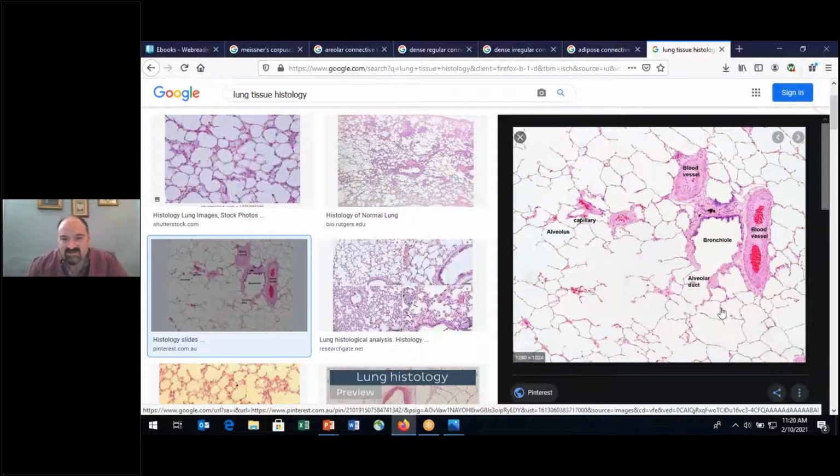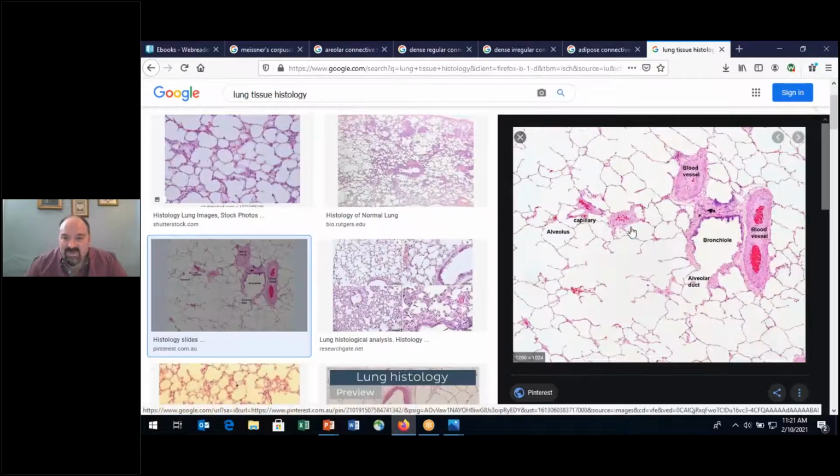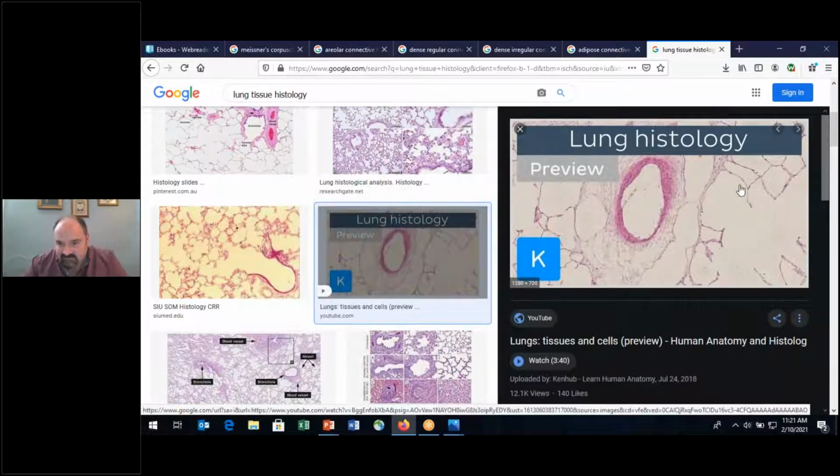So you'll see here, does this look a little bit like this? It does a little bit, right? But what I'm showing you is that with this one, they don't all come together. Some do, but some don't. You'll see that there are spaces and gaps, because these alveoli are little bubbles of tissue. And the tissue here, all these little lines, is made up of simple squamous epithelial tissue. That's what you're looking at there.